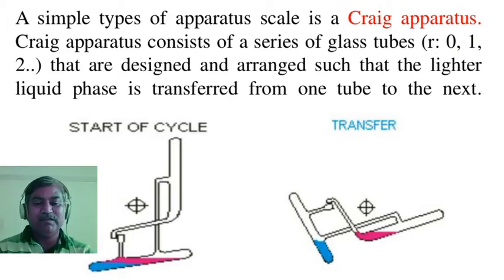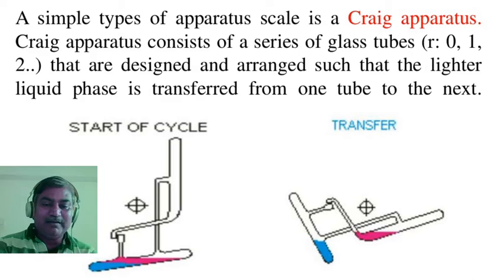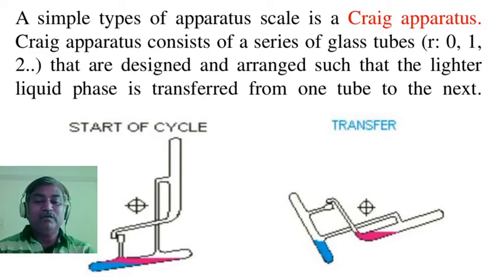Now the second phase shows the separation of the lighter density solvent in the vertical phase, and the blue colored solution goes to the other tube.